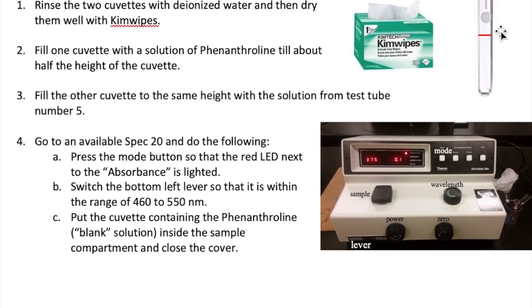First, get two cuvettes, rinse them well with water, and then dry them completely with Kim Wipe, which is shown here. Don't use regular paper towel, as that can scratch the surface of the cuvette, causing measurement errors. The cuvette has a circle and a line on it to help you differentiate it from the regular test tube.